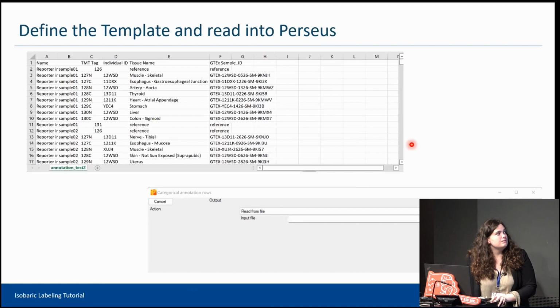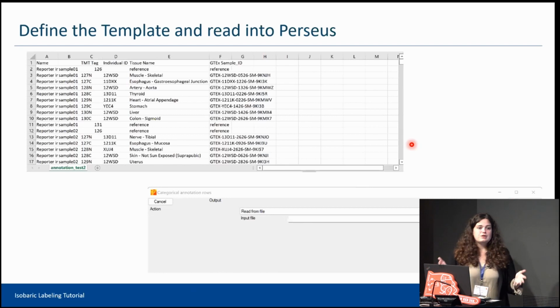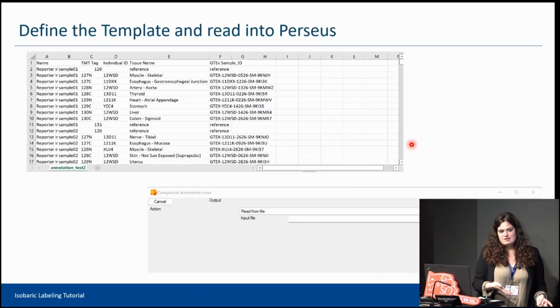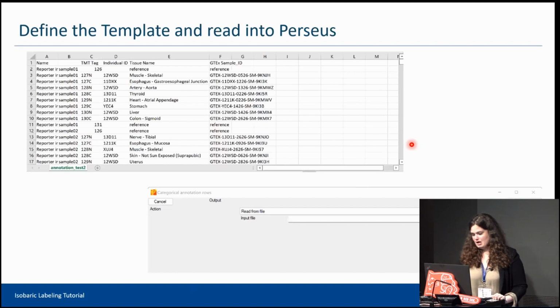As you can see from the experimental design, there are the reference channels, and sometimes, in this screenshot you can't see it, but there are also some channels that are called blank, that are basically the empty channels, because in this case, some channels were kept empty. But we need to remove them, because the reference channels or the empty channels we don't need. Yes, we need the reference channel, but we need it when we use MaxQuant, and MaxQuant we are already processing. Now what we need is only our samples, to see exactly if this normalization worked. So we need to filter, we need to remove the columns of reported intensity that are the reference ones and the empty channels. How do we do that?